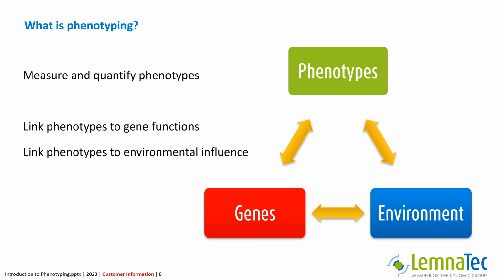So now, what is phenotyping? It is measuring and quantifying phenotypes. It is linking the phenotypes to gene functions and also linking the phenotypes to environmental factors.